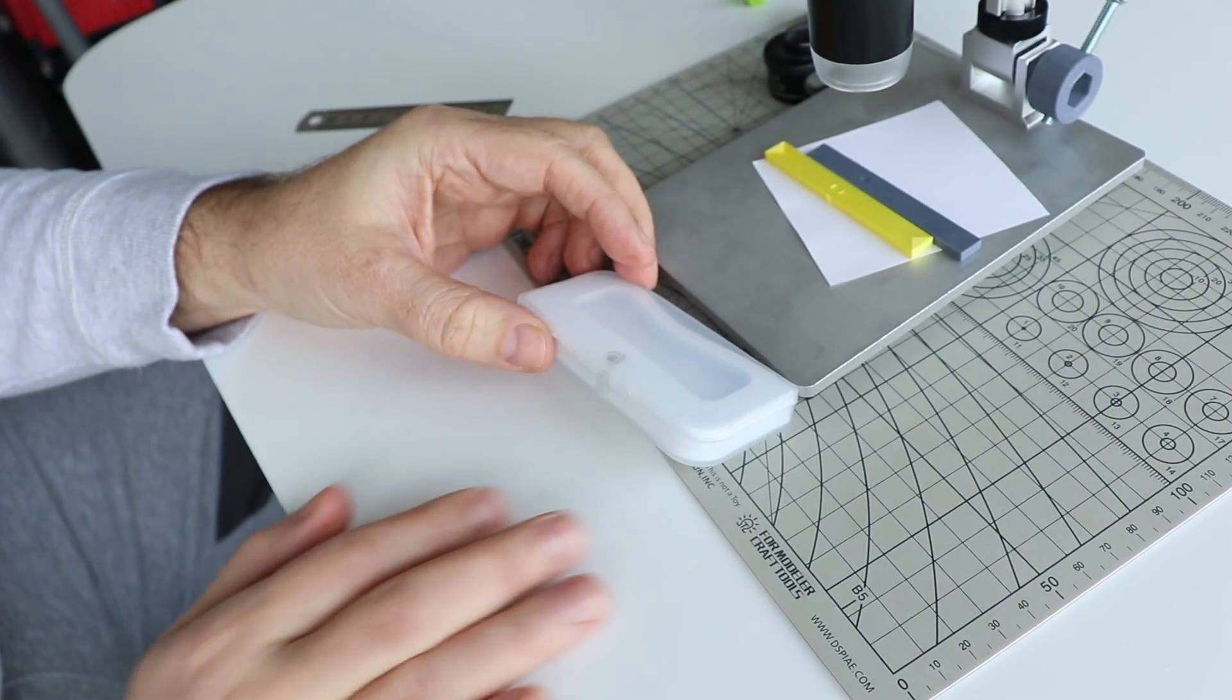And now the conclusions and final thoughts. Well usually when I did some kind of review from the Banggood product I got the comments that probably this is a special product for the reviewers. Well you can see now this is not the case because this is very nice product and it may be very useful but I'm really missing the 0.1 millimeter division ruler which was advertised on website. If I would buy this product I will probably send it back or ask for another one, but since I got this for free as you can see it's not always the advantage.